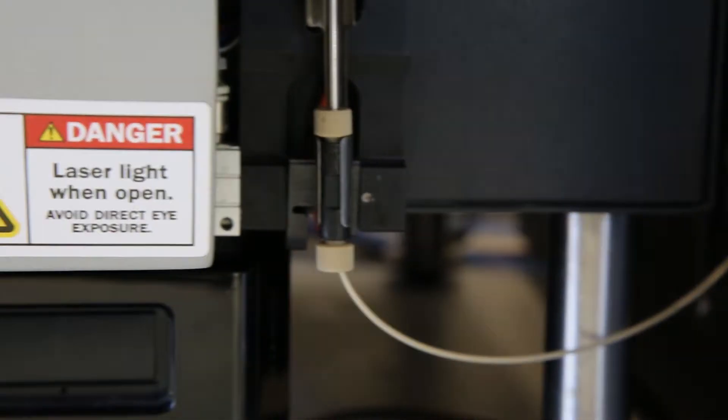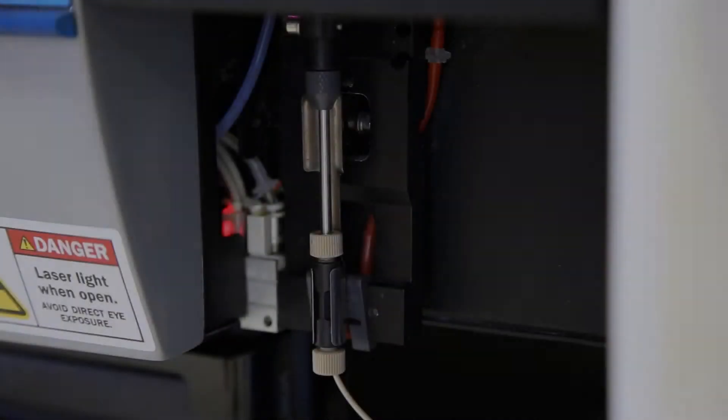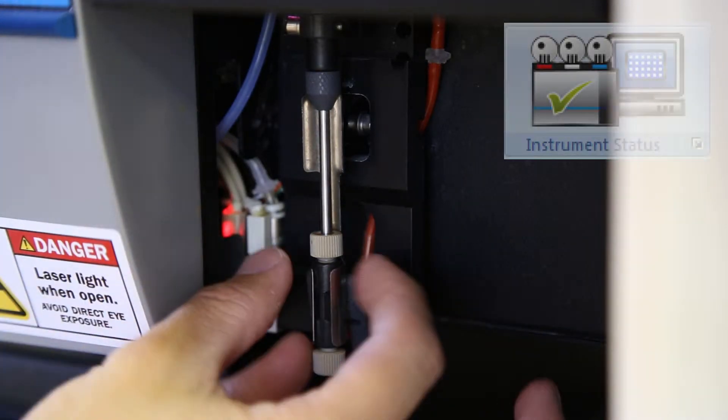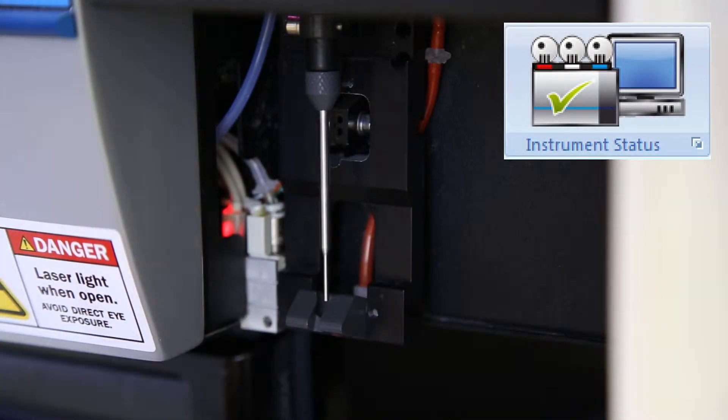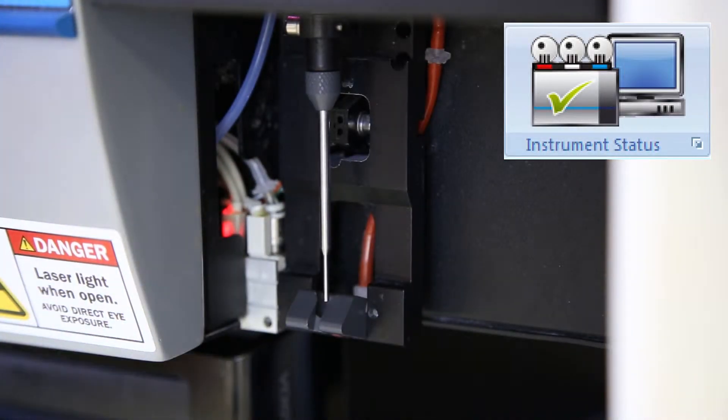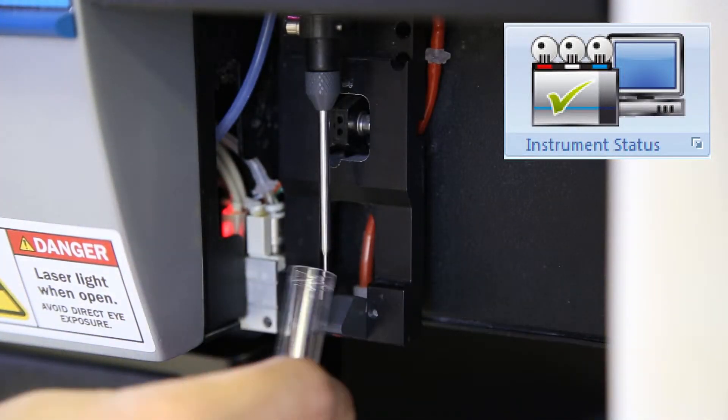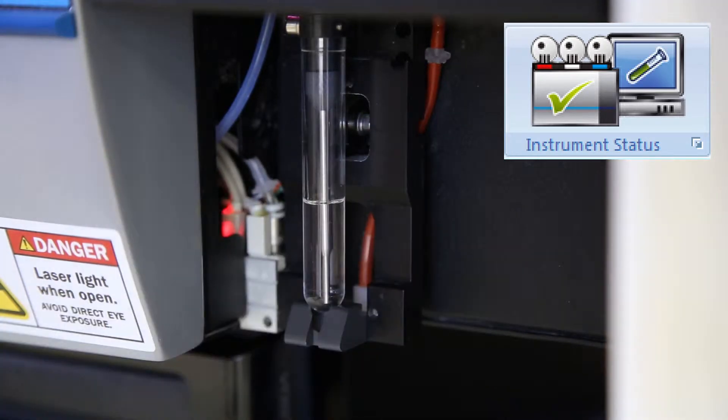The A600 makes it easy to switch between plates and tubes. Simply unscrewing the A600 connector lets the system know if you're using a plate or a tube.